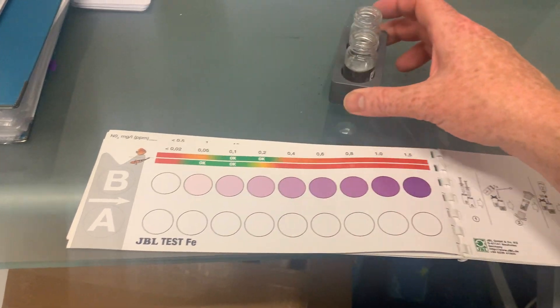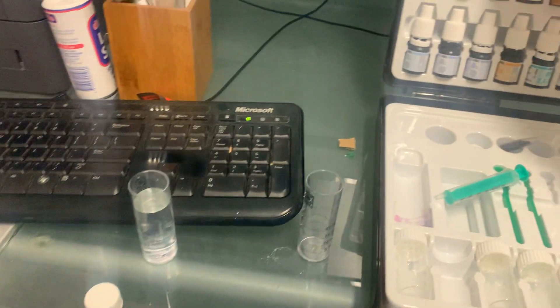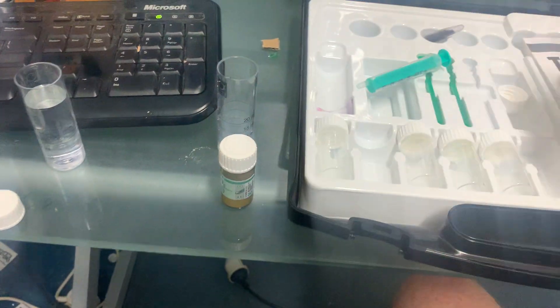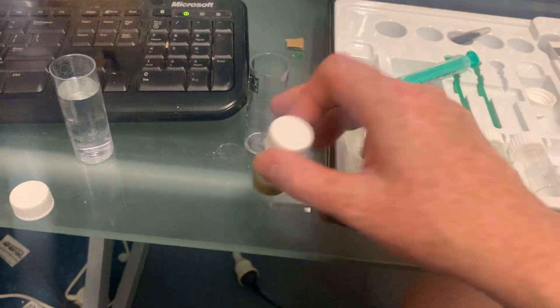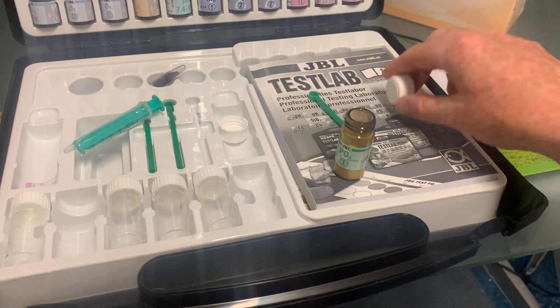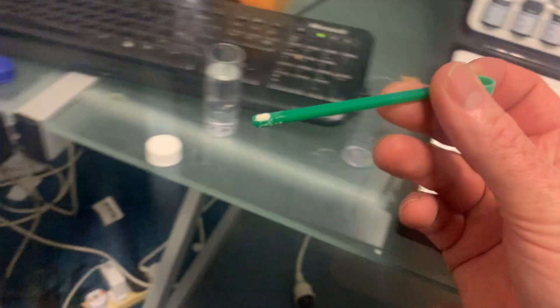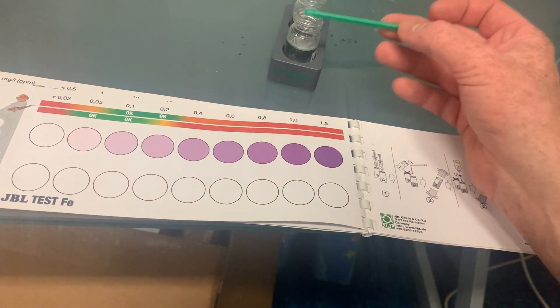Then we're going to put one spoon of phosphate reagent one — it says one spoon, so not the big spoon but the little spoon. I'll scoop that in there. Try not to get it wet because the wet stuff clogs it up. Get a nice flat scoop, then tap it in. Try not to get it wet.